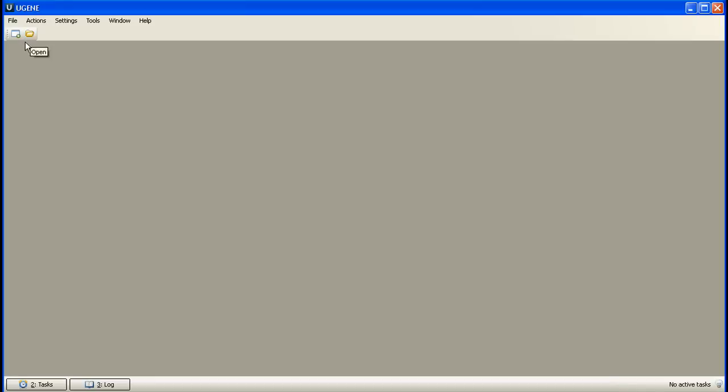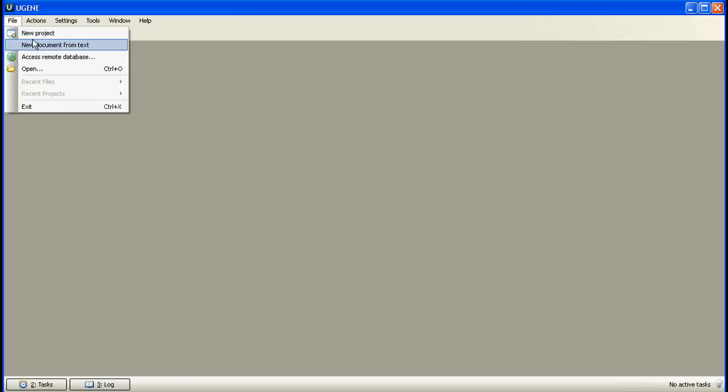But UGENE also provides us a way to work with items located at remote databases available in the internet. Let's see how it works. To begin with, click File and then Access Remote Database from the menu items.